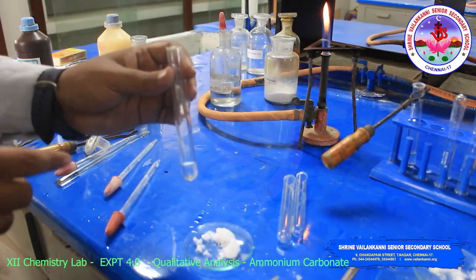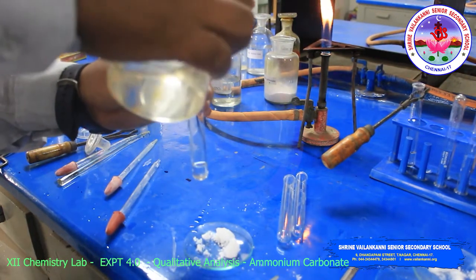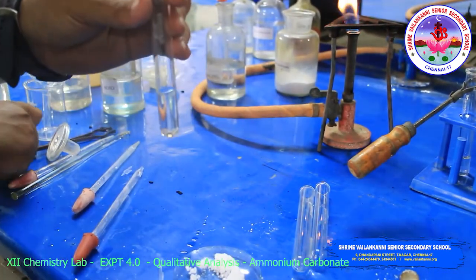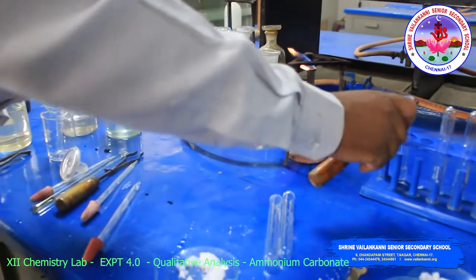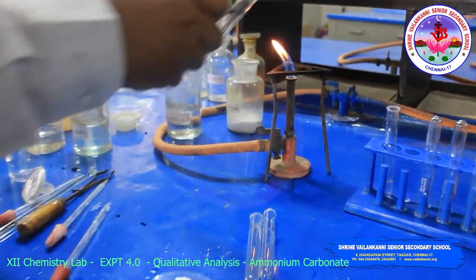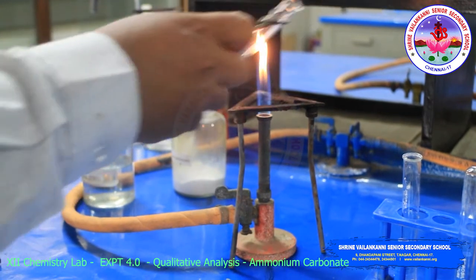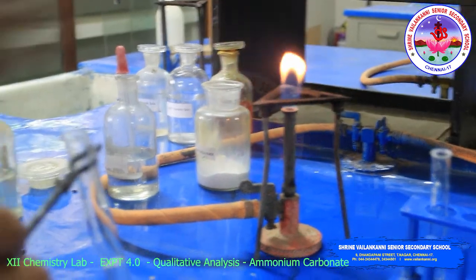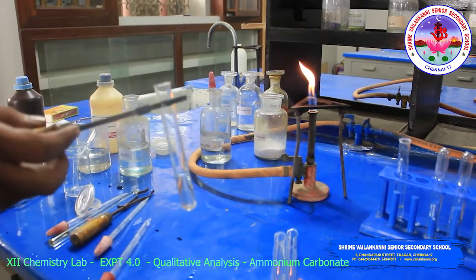Now the next test is the sodium hydroxide test. This is the original solution. I am going to add sodium hydroxide solution and warm it. The characteristic smell is evolved, that is the ammoniacal smell. So ammonium is confirmed.